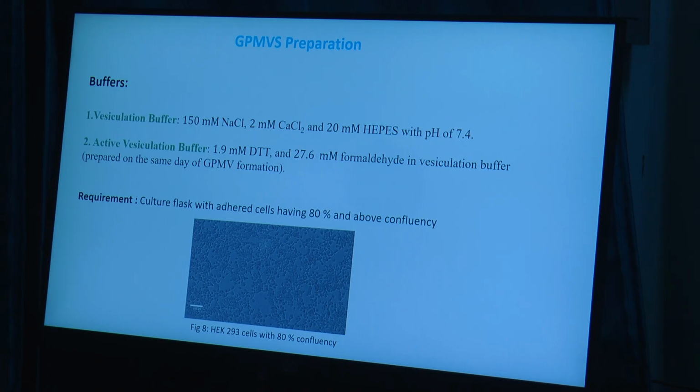Now in our experiment, I have arranged to add some cells in 6-well plates. We were not having individual ones, so six of you can use one plate, but you can individually use each section. First we can visualize the cells, we have a cell imager. In that we can see the confluency.